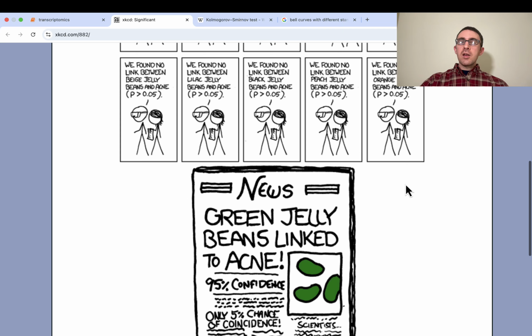And the way we're going to put a number on that is with something called the log2 fold change. This is something you see in papers a lot, papers doing gene expression analysis. They often use the log2 fold change to talk about the difference in means between different conditions in terms of gene expression. It looks like a little bit of confusing math, but it's actually not that different. Maybe I'll just type some things out to explain what's going on here.